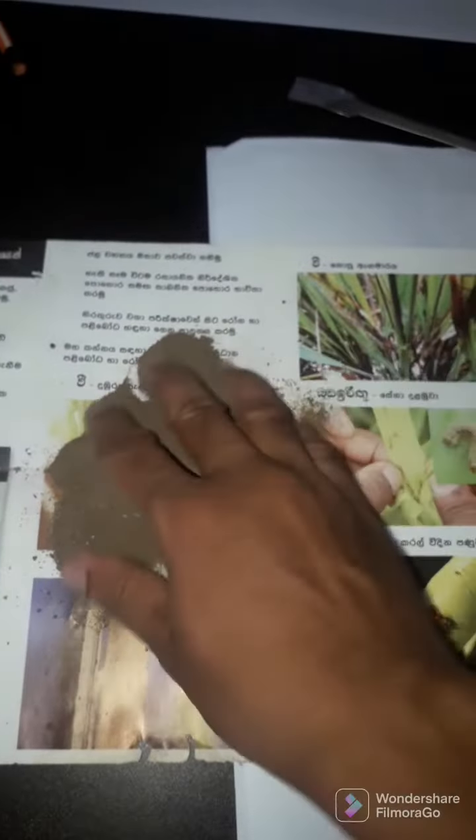Welcome viewers. In this video I am going to explain how to find phosphorus level in paddy field.